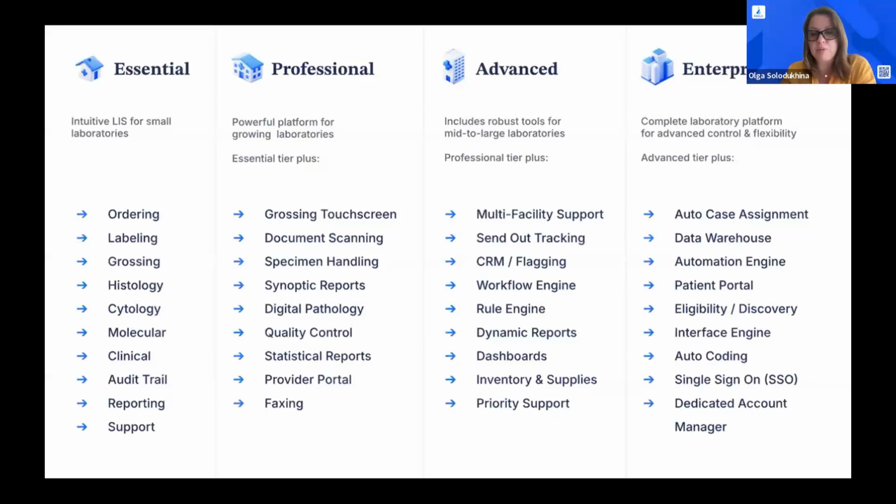Today, we will have a look at some of them. And if you feel like you want to learn more about some of them, come back to us, have the demos for your company, and we'll keep talking from here and discussing what type of system will be the best fit for your particular lab. With that said, I'll give it to Allison to continue showing us the basic flow of the AP module and the things that Michael mentioned before.